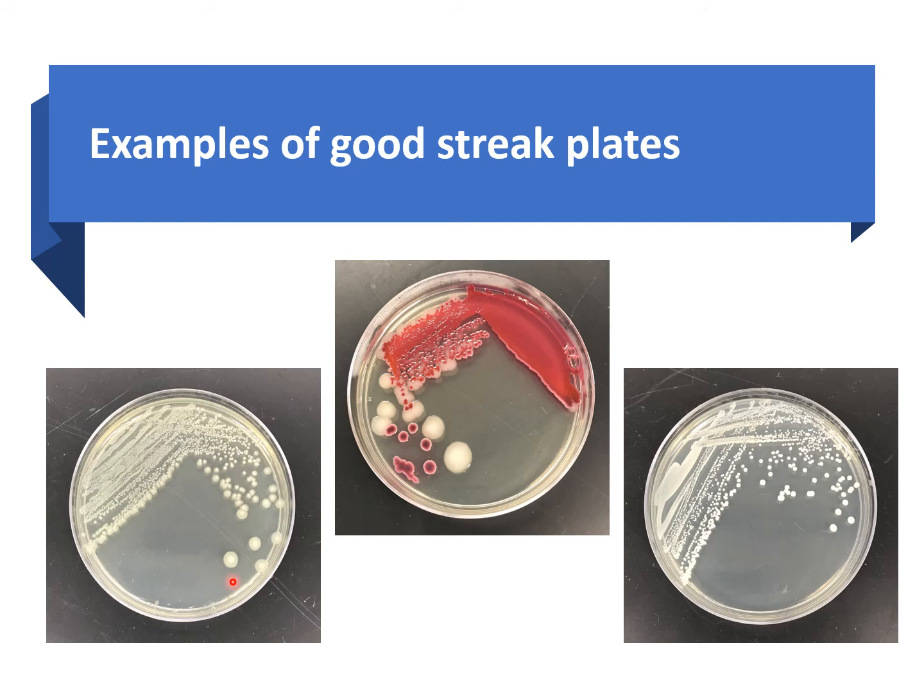Okay, now take a look at this plate right here. Again, see how the first quadrant, it's a pretty heavy growth of bacteria. The second, we have less. Notice how here, right here, you achieved those single colonies. Sometimes they do only 3 quadrants, by the way. Sometimes we do 4. I mean, the more quadrants, by the way, that you have on a plate, the better, okay? So right here, you can kind of see the single colonies, okay?